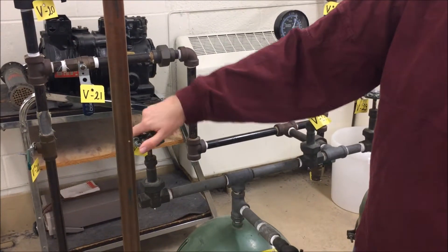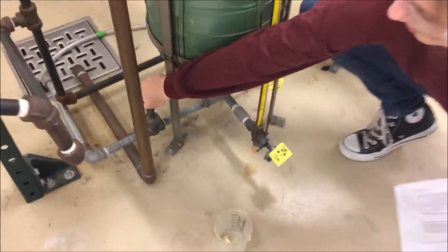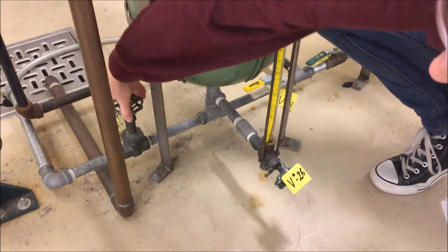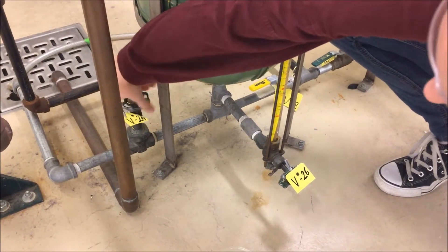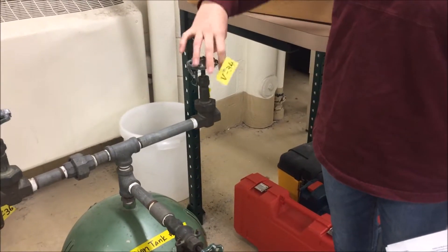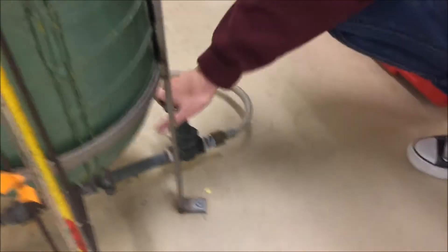To drain condensate collection tank 1, open valve V23 at the top and V24 at the bottom. To drain condensate collection tank 2, open valve V34 at the top and V35 at the bottom. Once these tanks have been completely drained, close all pre-listed valves.